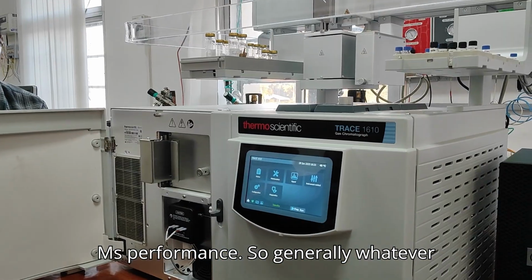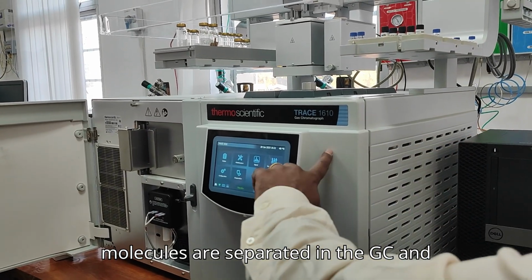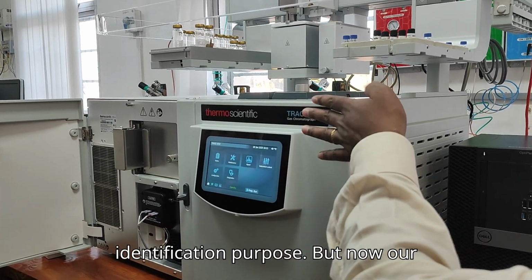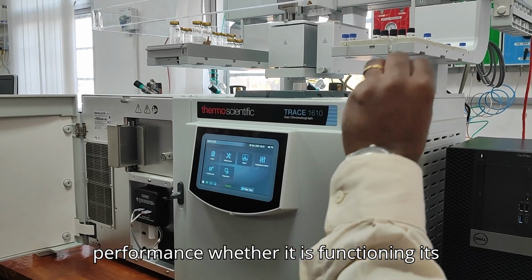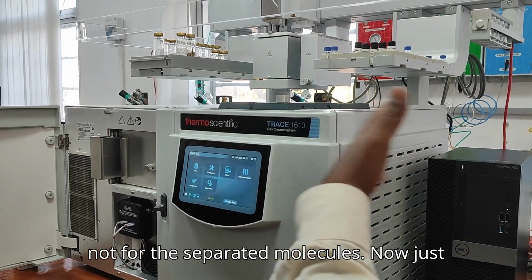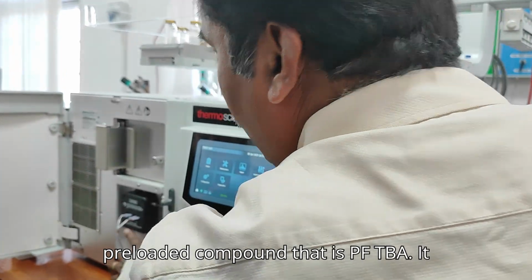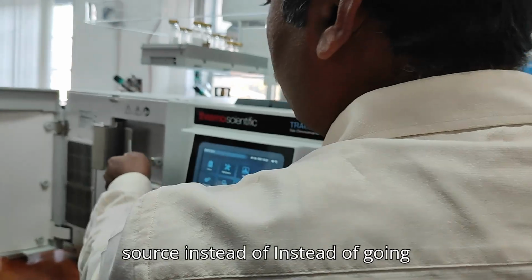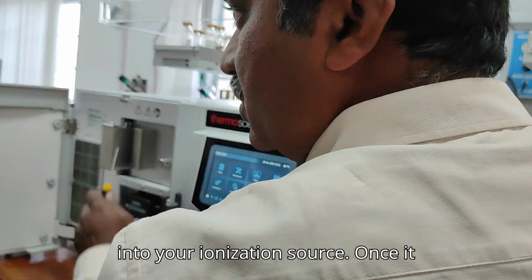In our routine analysis, the molecules are separated in the GC and go to the mass spectrometer for identification. But now our purpose is just to check the MS performance, whether it is functioning its role properly or not. Our intention is not for separated molecules. So we have a preloaded compound, PFTBA. Instead of going through the column, it goes directly into your ionization source.